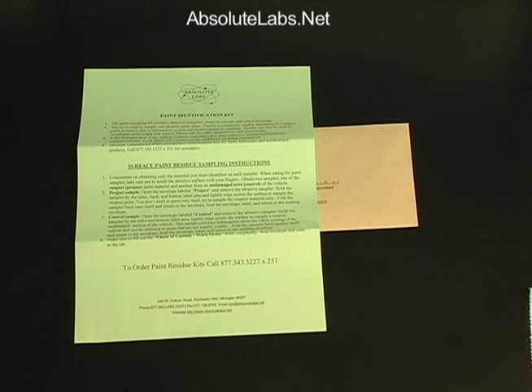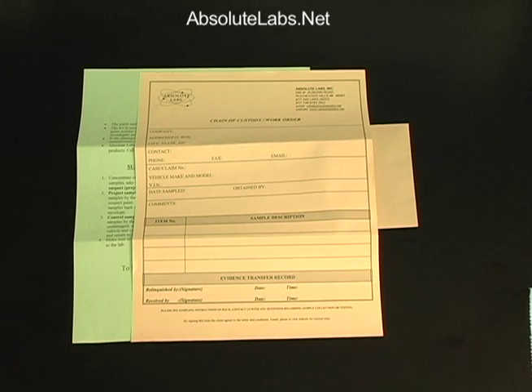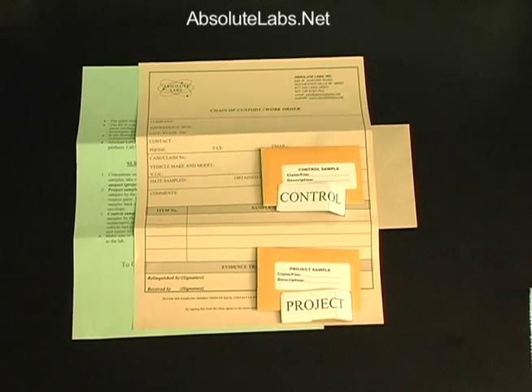Your Paint Identification Kit contains everything needed to identify unknown impact residues found on vehicles. There's a detailed instruction sheet, a chain of custody — please make sure to sign the relinquished section of that sheet. You'll also find an abrasive sampler device for the project or suspect area, and a control abrasive sampler device for comparison.